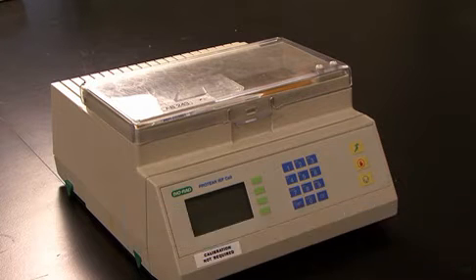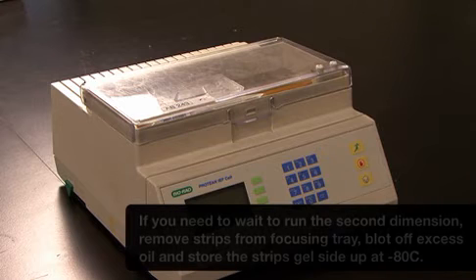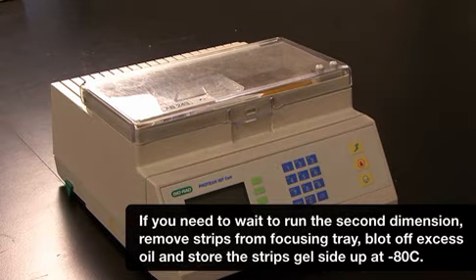At the completion of focusing, if you do not have time to run the second dimension gel, first remove the strips from the focusing tray, blot off the excess mineral oil, and place the strips into a rehydration tray at minus 80 degrees C.